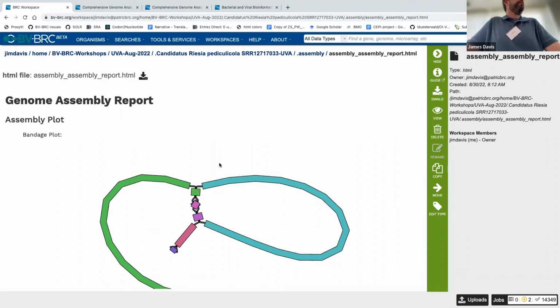I want to know what defines the presence or absence of a plasmid, because you could extract a pure plasmid, or encode a pure plasmid, and try to assemble it or do annotation. And I see my Bandage plots almost closing as circular, but it still reports to me that there is no plasmid.